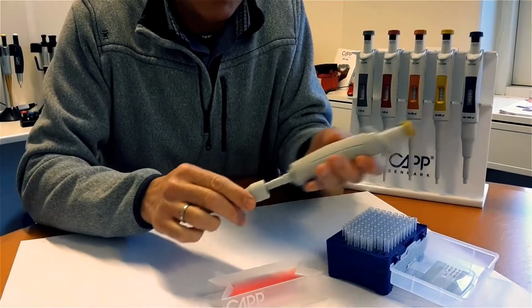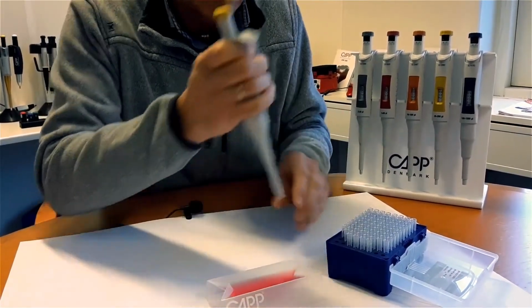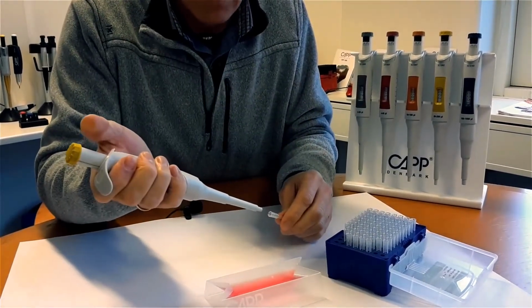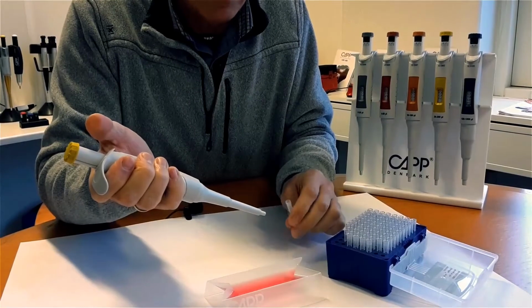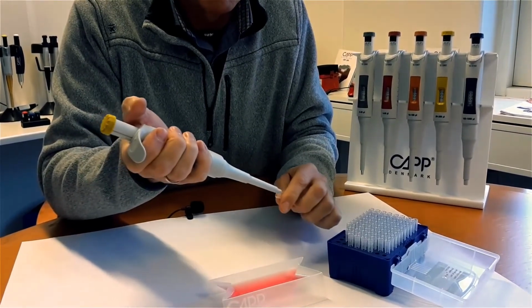Screw it gently back onto the pipette. Perform the test once again. In case of any discrepancy, please contact info@capp.dk.